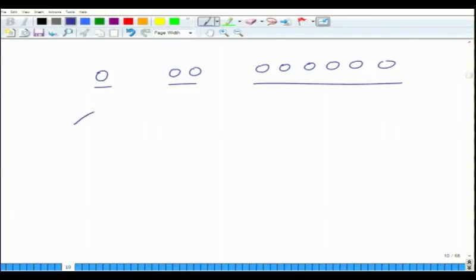So this will give you one broad peak, this will give you a sharp peak, this will give you an even sharper peak. There is a whole analysis on the intensity as a function of the number of slits. As the number of slits increase, the envelope of reinforced beams becomes sharper. So when the number of slits goes up, it becomes very sharp.